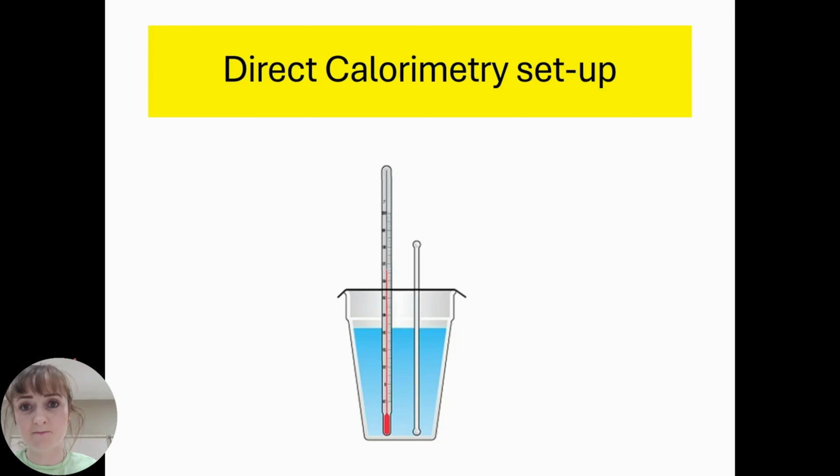In this video, we will only focus on direct calorimetry, and a separate video will focus on indirect calorimetry. Because the focus of calorimetry is measuring the temperature change associated with the reaction, the focus is on making sure that the setup ensures the accuracy of that temperature change.